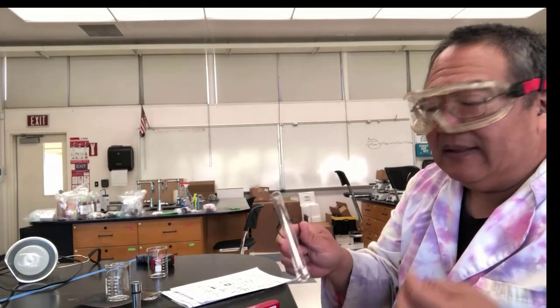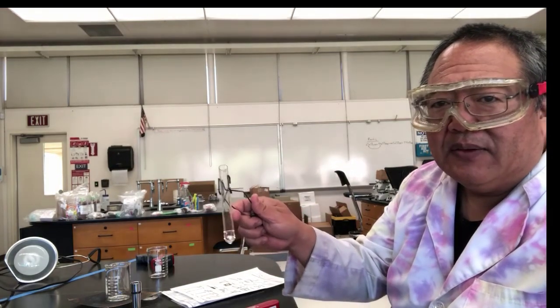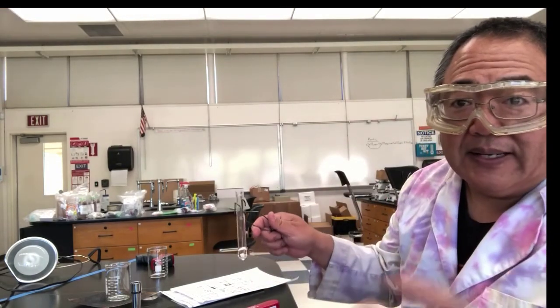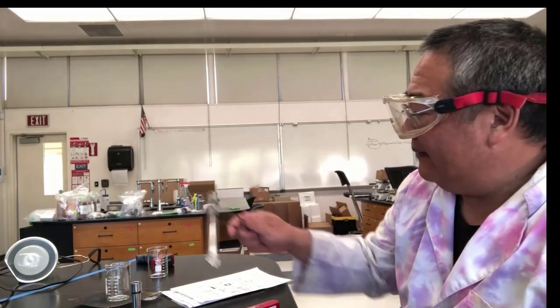So when you're heating a liquid in a test tube, and we try to avoid doing that kind of heating in general chemistry, we usually do it in a beaker and it's not as big a problem, but it can happen. We try to avoid some of that in Chem 1A or Chem 1B, just because it can cause the liquid that you're heating to shoot out and spray onto somebody across from you. If I had filled the test tube up, the whole contents of the test tube would have shot out. All right? So that's one more thing to be careful of as you're heating substances in a test tube. There's the possibility that it'll bump and shoot all the liquid out of the test tube.